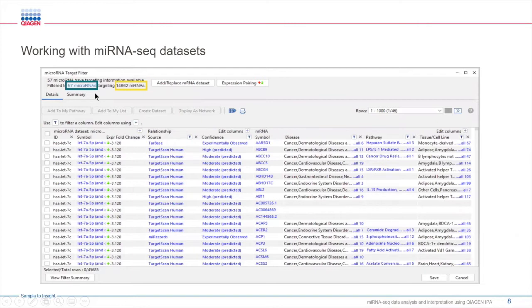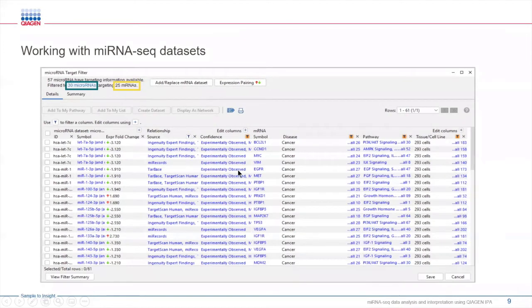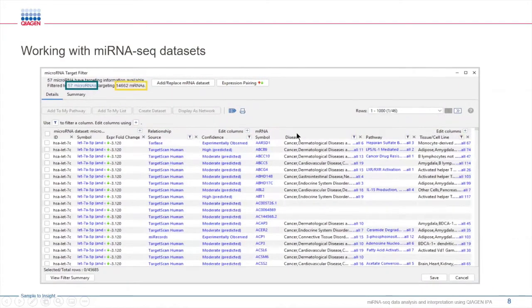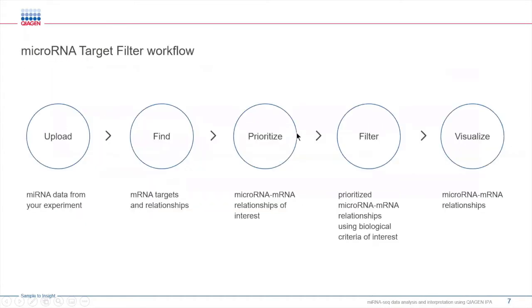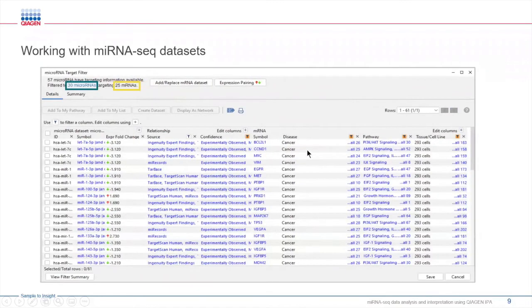The microRNA target filter, which utilizes IPA's powerful regularly maintained database, allows you to take this list of thousands of targets and refine it to a smaller set that is more relevant for your research by filtering for biological content, such as specific diseases.